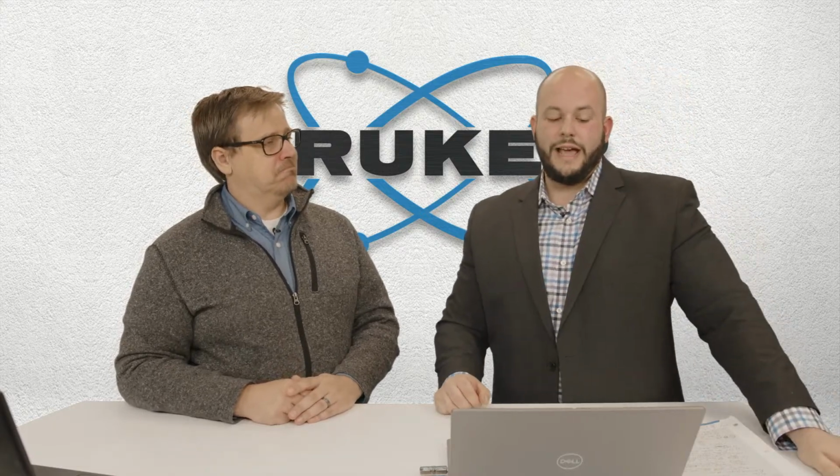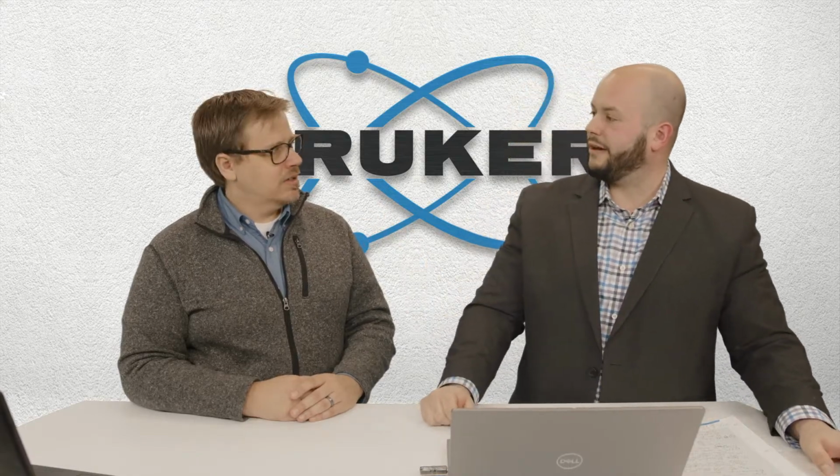So Stanley is asking, what if I want to measure multiple points on a sample, like a large wafer? That's a great question. We actually just built into the newest version of the software a module that'll allow you to look at different points on a wafer. So wafer mapping is a feature now in the software. It'll give you a map of it. There's a great example on the website for DIFFRAC.XRR.